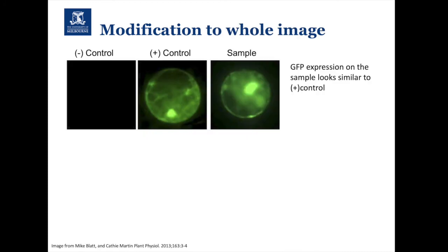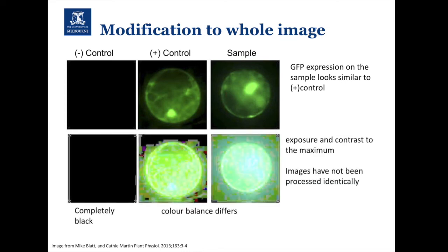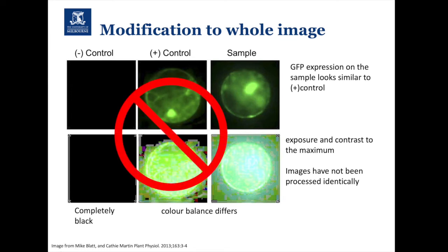Here's another example I quite like: we have a sample, a positive control, and a negative control — hopefully used to set up the acquisition settings. But if we do a simple contrast adjustment, the negative control is completely black. You will never get a completely black image off a microscope — there's always some electronic noise from the detector contributing some intensity. You can also see the background differs between the positive control and the sample, suggesting these images may have been acquired differently or treated differently in terms of visualization. So again, not ethical.